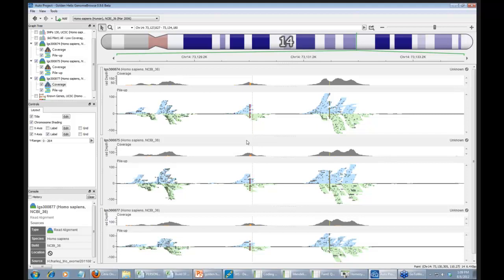When we looked at the data, we said that if we use 10, we're going to get rid of about 80% of our false positives, and we still would have been able to detect all of the de novo polymorphisms that we did validate. That's where we've set our threshold. It's based on experience, and as we continue to do these experiments, we keep looking at those measurements to see whether we could move it up to 15. If we move it up to 15, would we still have detected all the ones that we validated and get rid of some of the false positives or not? That's still very much under development.